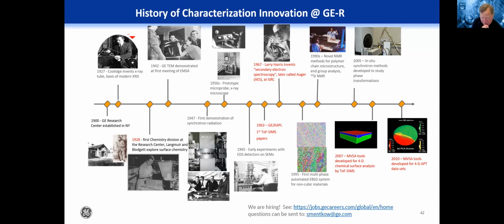That's always a good question. So Auger is actually being used more heavily than people see. The important point to note is the semiconducting firms use it very heavily. However, they cannot share what they're learning. So there are many Auger analysts out there. However, they're not presenting.